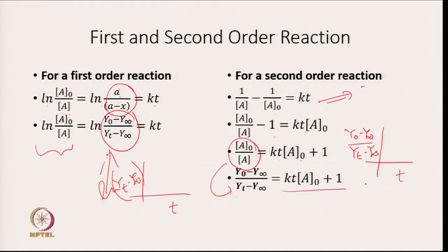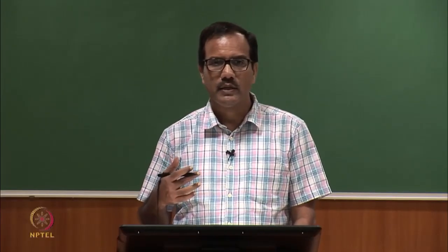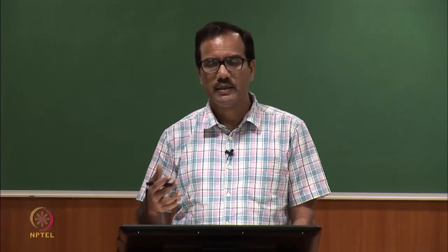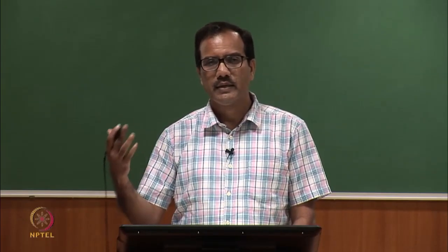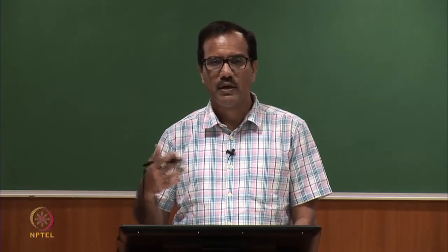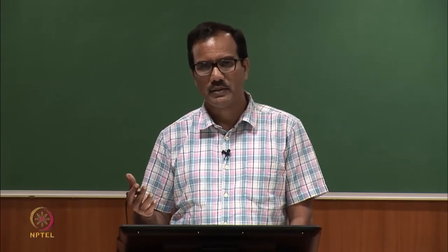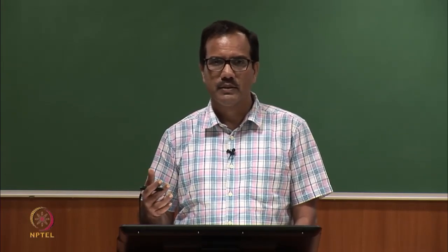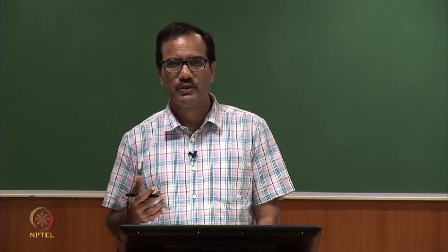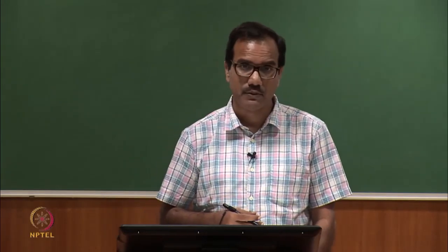So a spectroscopic signal not only gives us a tool to measure delta G, K, delta H or delta S, it also gives us a tool to measure the kinetic parameters. So I will stop here. Next time we will discuss time resolved spectroscopy.